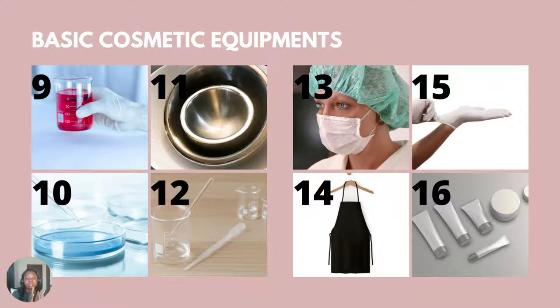Number 13: you always need to have a nose mask and a hair net. You need to cover your hair and cover your nose — this is very important. Number 14 is an apron. We need an apron when making skincare or cosmetic products, just in case something pours on you so it doesn't affect your clothing, or if it's something corrosive, it provides a barrier protecting your skin. Number 15 is hand gloves. You shouldn't use your bare hands to formulate cosmetics — it's not hygienic.